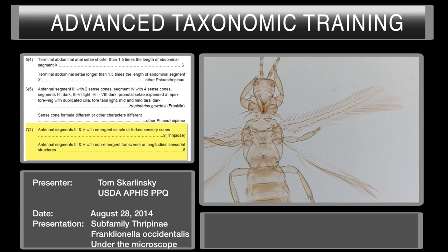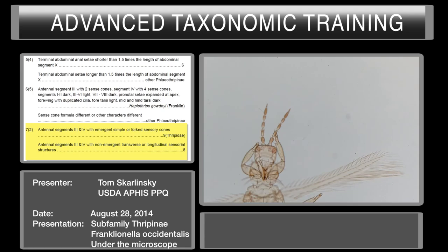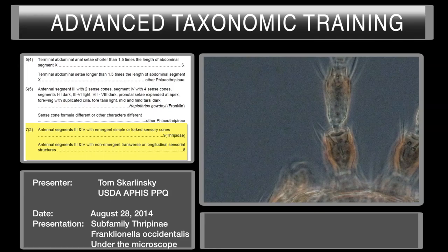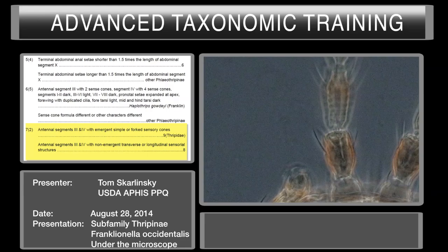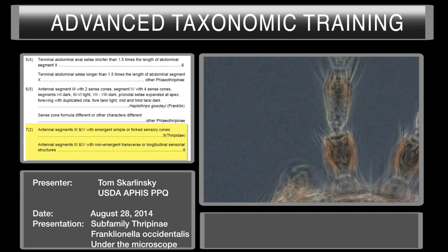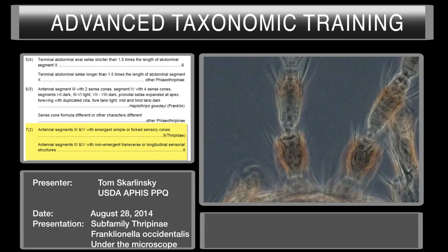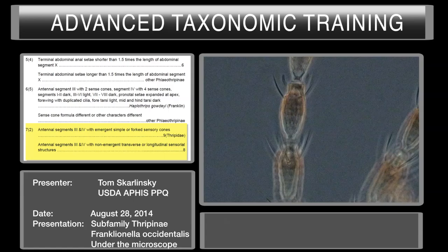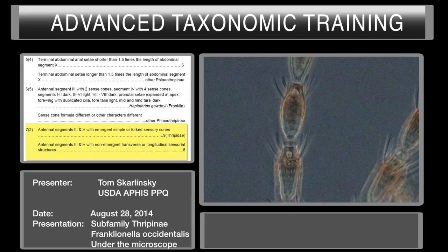Let's go down to couplet number seven in our key. In our antennal segments three and four, are our sensory structures actually on the antennal segments, or are they coming out of the antennal segments? We're on phase contrast. Let's go ahead and count our antennal segments. What we're interested in is three and four. So let's go ahead and look at three and see if we can see that U-shaped or horseshoe-shaped fourth sensory cone.